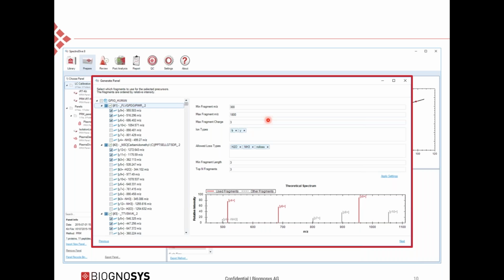After selecting a set of proteins and peptides, the next screen is then showing you all the different proteins with the peptide selected. And here on the right side, based on the automated feature settings, the fragments that are chosen for monitoring. As you can see here, for all the peptides, we are selecting the top 3 fragments with different settings here.